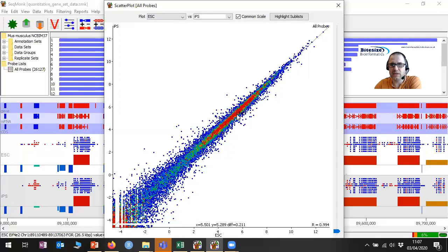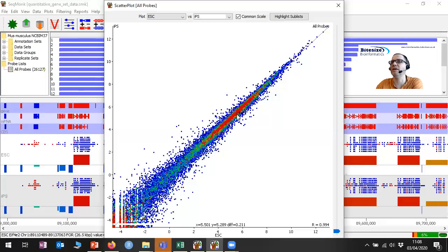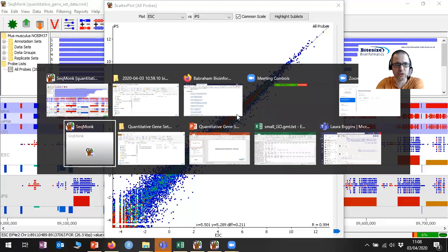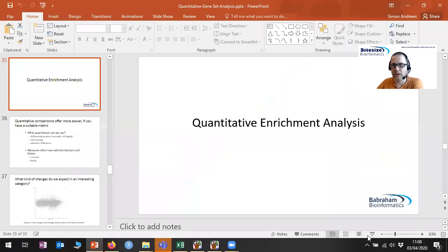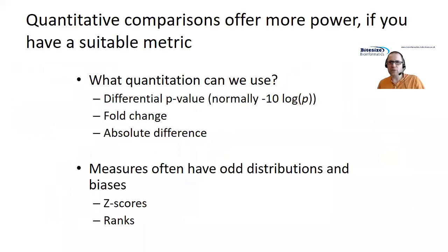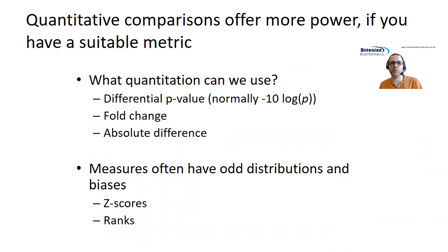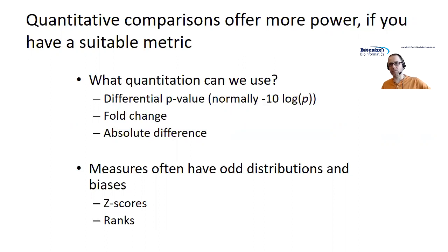Just to go through some basics: the statistics we're going to use depend on the type of change we think we're going to find. There are two basic problems to address. One is what the actual quantitative value we're going to use will be, and the second is what kind of statistical test to use to find a difference. We could have run a traditional differential expression analysis, but without filtering for things that exceed certain p-value limits — just give me the p-value for everything and use that to quantitatively rank the genes.